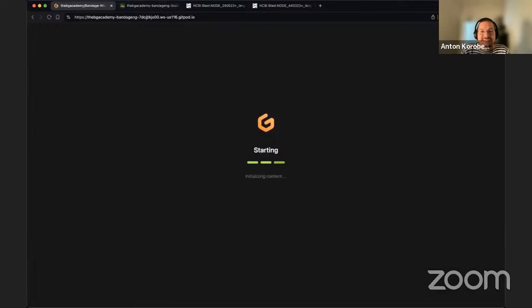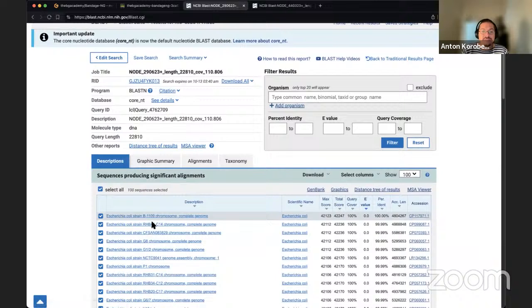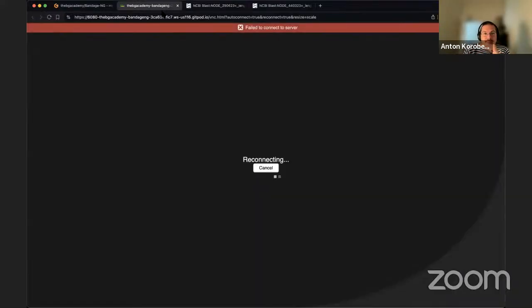But funny enough, that was the last thing that I wanted to show you, so we have not lost much. The second species is certainly E. coli. Well, that's a pretty standard problem in MAGs when you have both Salmonella and E. coli, they're usually very, very interspersed.